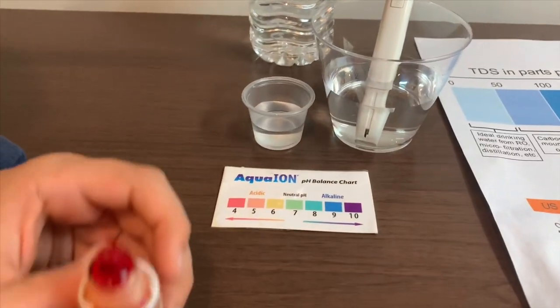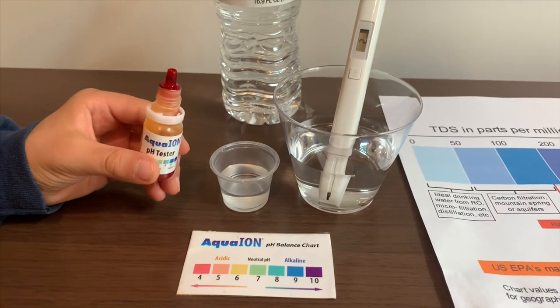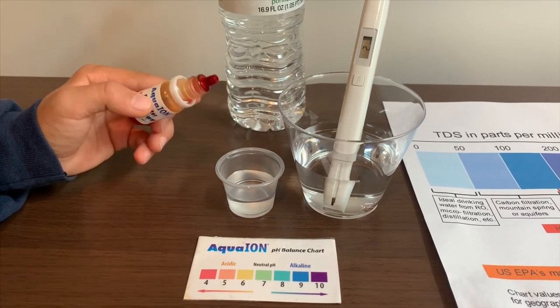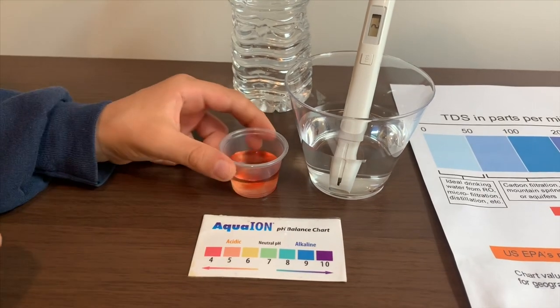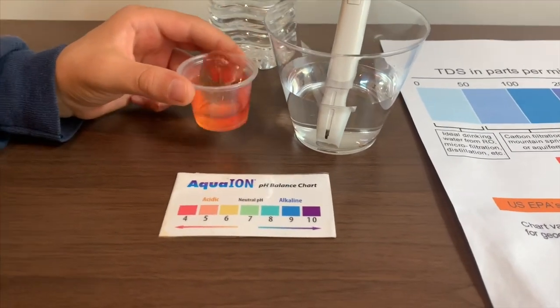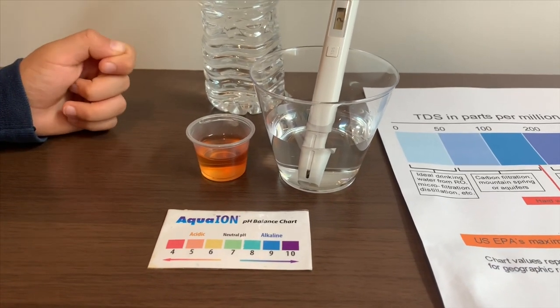Now let's test the pH level. If you want to buy this pH tester, check the link down below. Only do two drops. Let's stir it for a better result. I give this a 5 — this is acidic.